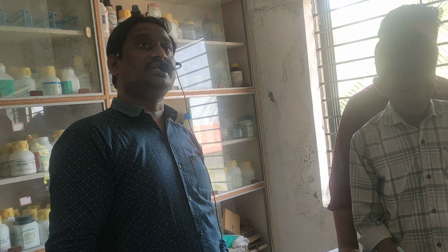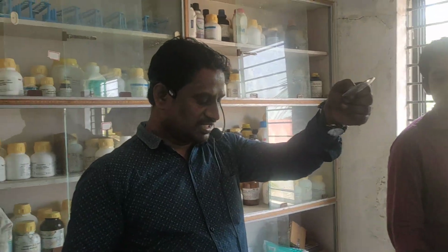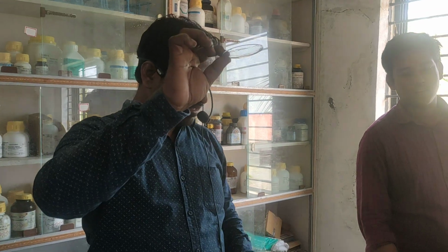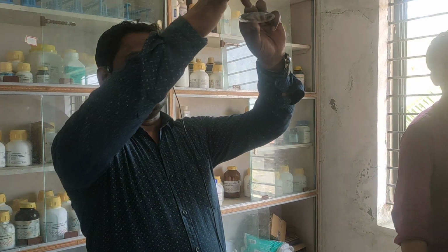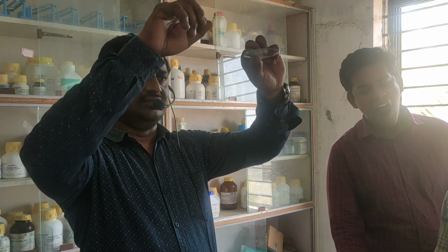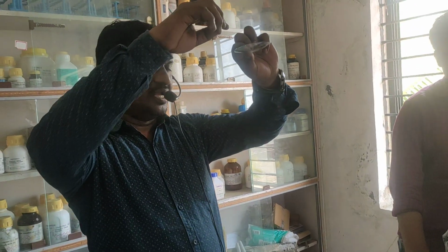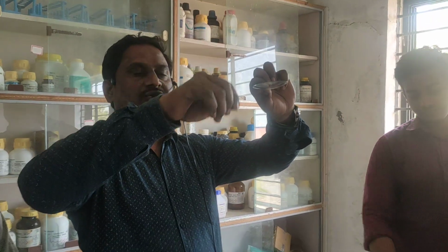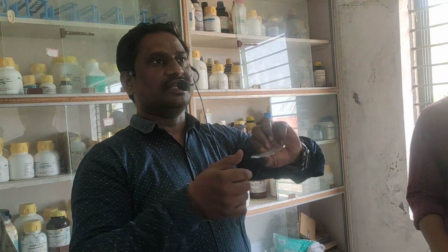Now one more confirmation test is there for Ca plus 2. First, take the given salt in a watch glass. Add only one drop of concentrated HCl and make a paste. Bring that paste near the flame, and you will get brick red.